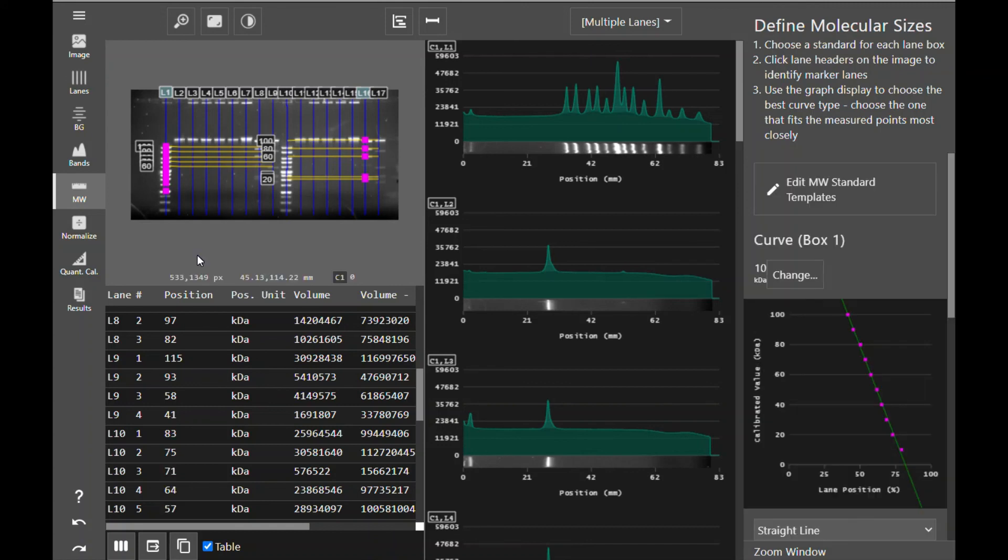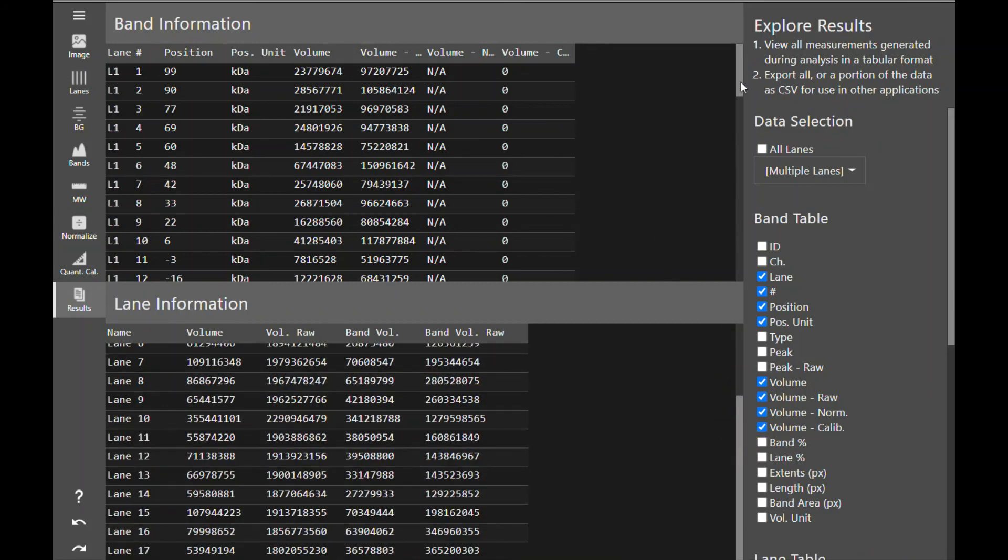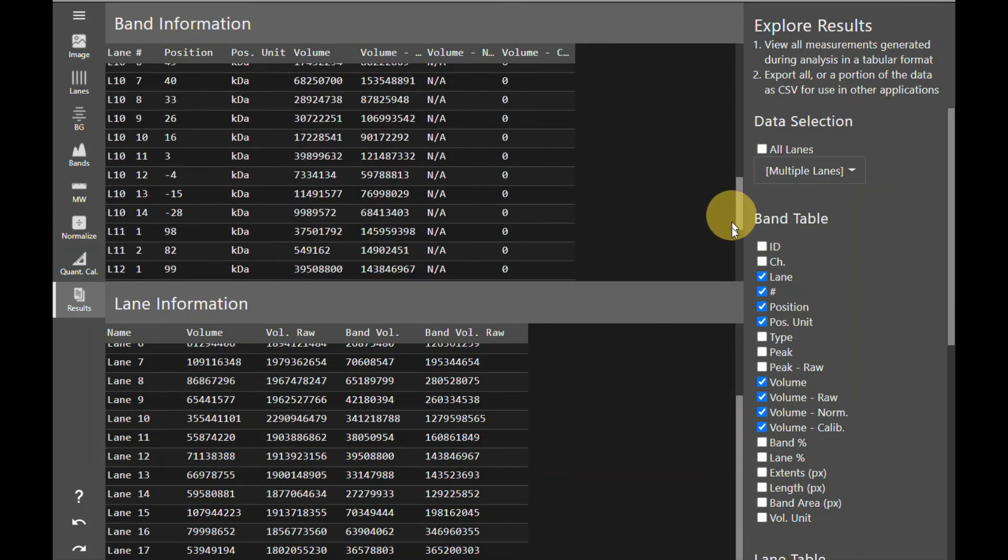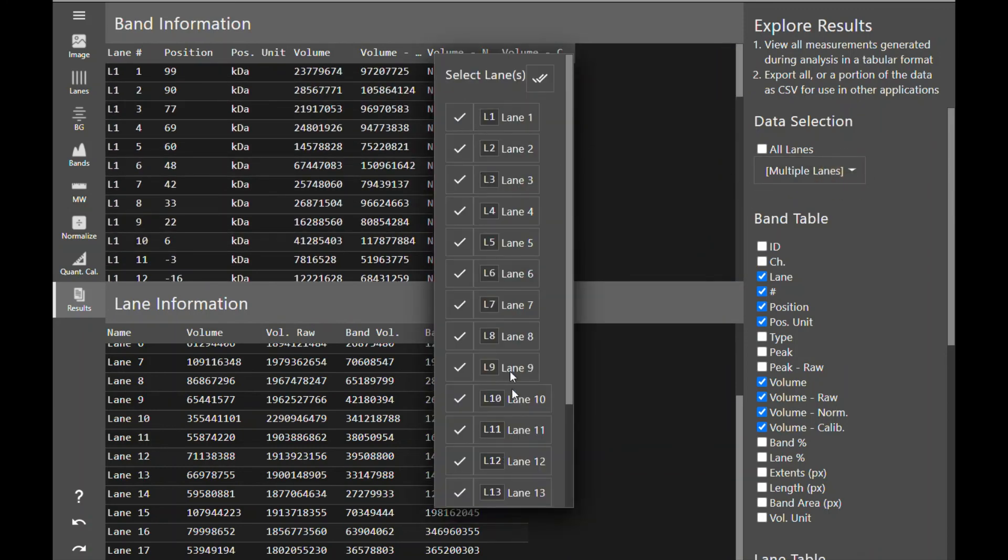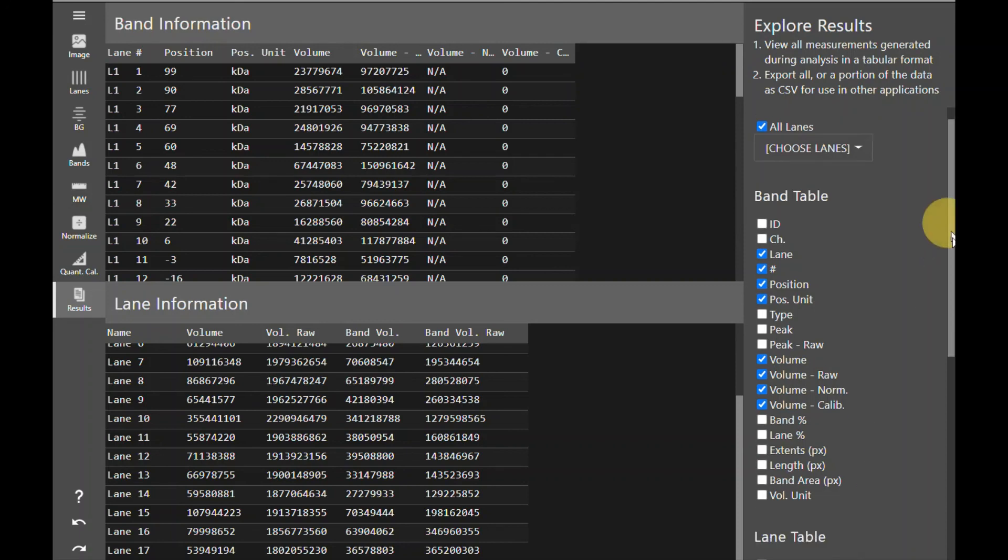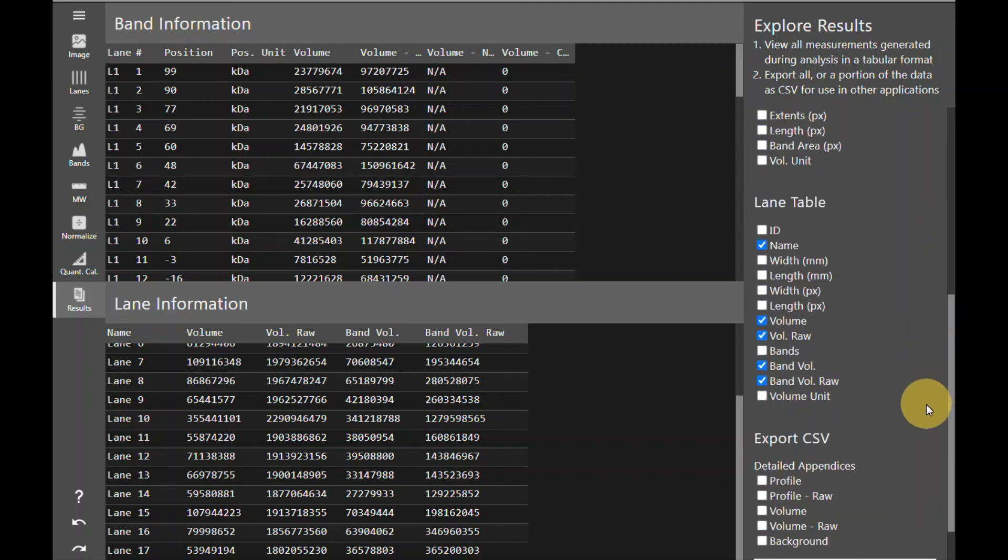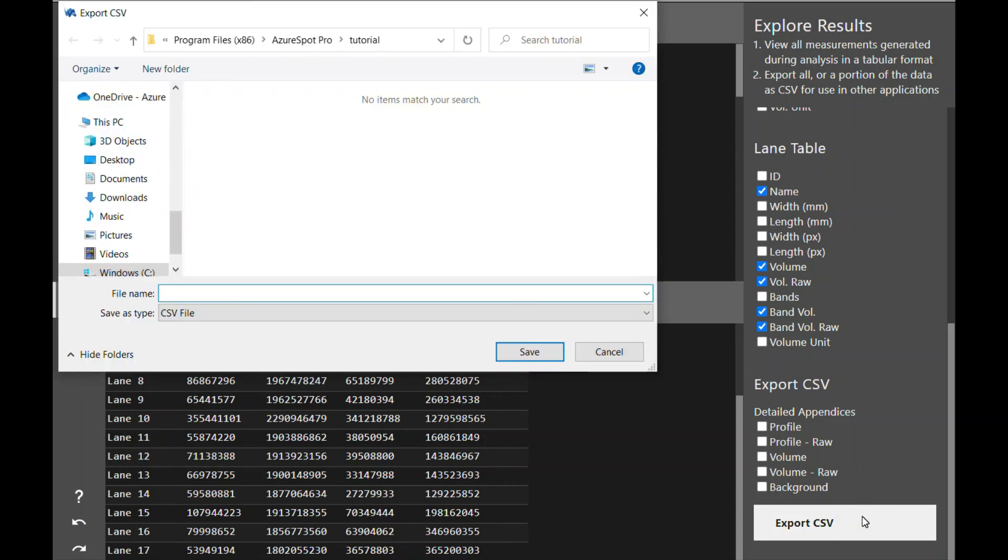For most users, this workflow of creating lanes, subtracting background, defining bands, and determining the molecular weight of your bands is all you need and you can move on to the results tab. From the results tab, you can view all the lane data and all the band data generated from your analysis. You can select which lanes you would like to view or select all lanes. At this point you can also fine tune the data displayed in your band table and your lane table and choose to include any detailed appendices. Once you have selected all of your desired data, click Export CSV to export your data to a spreadsheet.